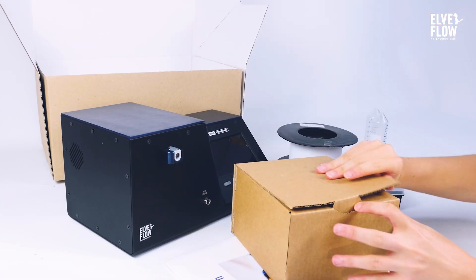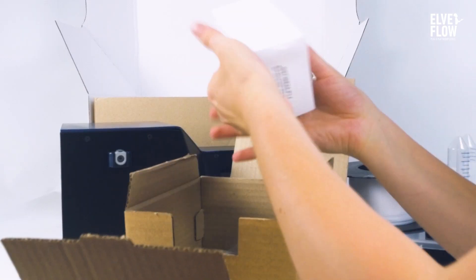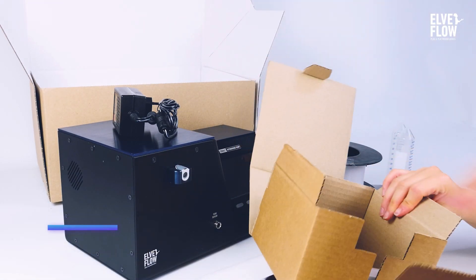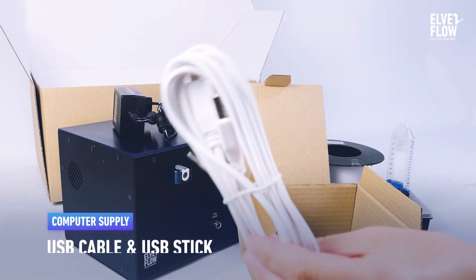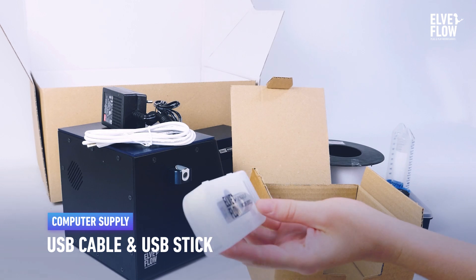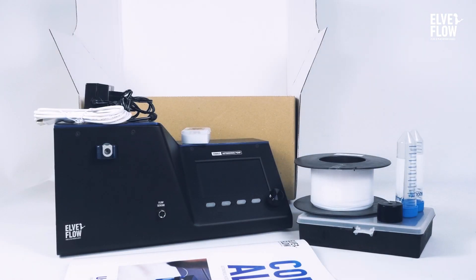In this little box, you'll find the power supply, a USB stick with the Cobalt software, and a USB cable to connect Cobalt to your computer. But remember, this instrument is fully autonomous, and the use of a computer is optional.